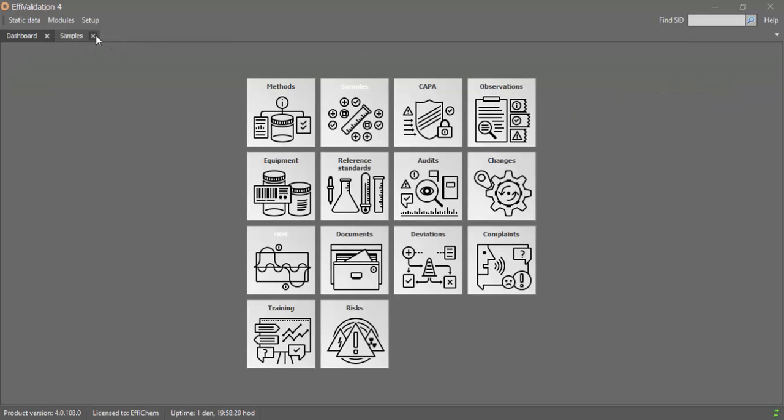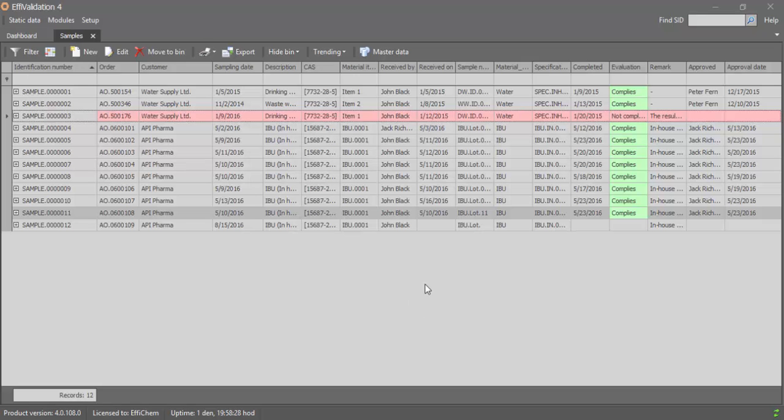Another feature of EffiChem which we feel is very important for the lab is the ability to run quality trends against our data. Quality is a very important feature of any laboratory, and adverse quality events can have an impact not only for things you can easily identify like recalls or rework, but also have a negative impact on events like staff overtime or company reputation within the market. So EffiChem makes it very easy to get information about quality trends.